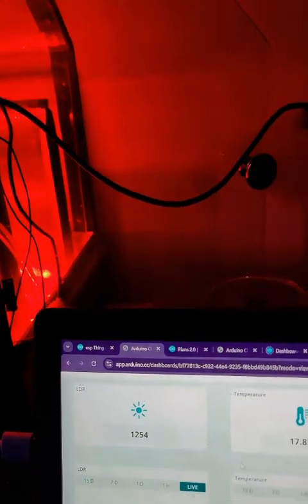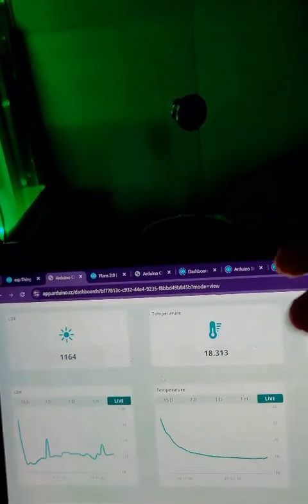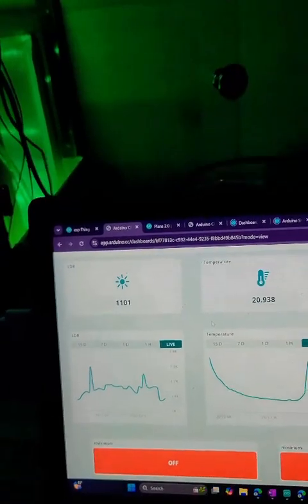So before it was just blue, green, blue, green, blue, green, which doesn't mean anything. But now we're actually using colors to represent something or a process. Now we're heating up the system. It becomes green again because I touched it, so it becomes warmer.